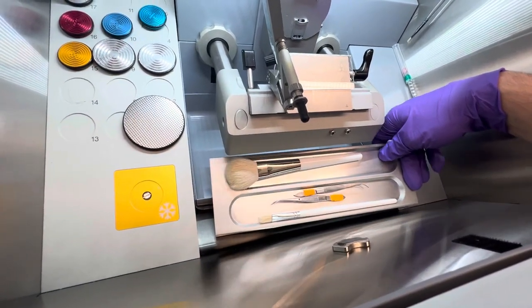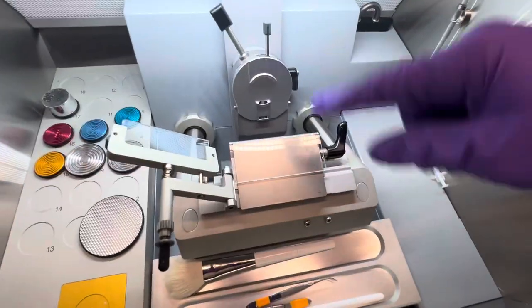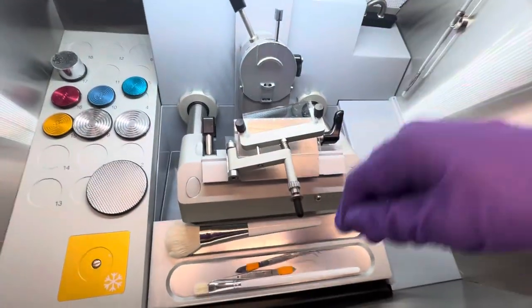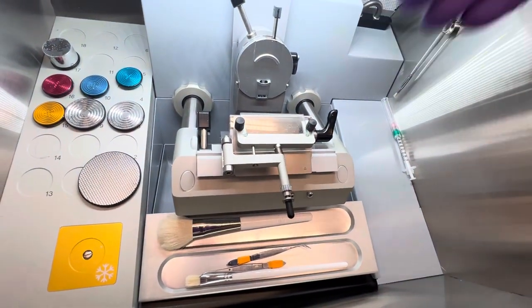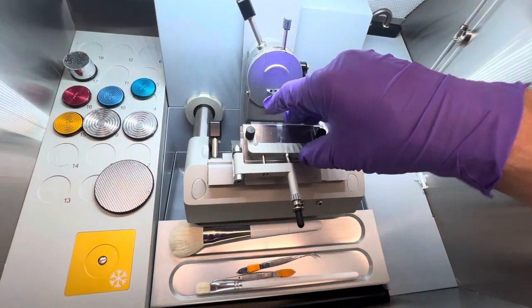In this case, this will move out of the way, and you can see in there is a waste bin that can slide out. So anytime that fills up with a bunch of excess OCT shavings from when you're chopping it off, you can just pull that out and toss it into the bin, unless there's tissue in it. In that case, usually it'll produce a roll of tissue. Ideally, in an ideal situation, we're not rolling it, but that's just the technique we have right now. Maybe it'll be different for you.